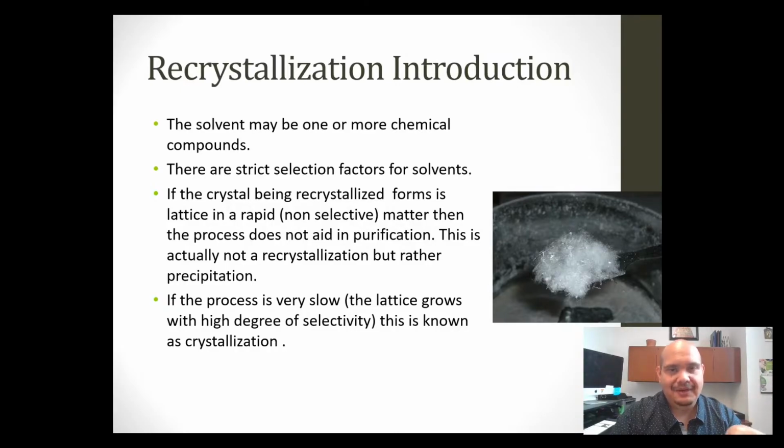Take a moment to pause this video and think why mixing ethanol and hexane to recrystallize a solute that has polar and nonpolar compounds is probably not the best idea. Pause this video and think about it. Write it down in your notebook, and then I'll give you the answer when you come back.